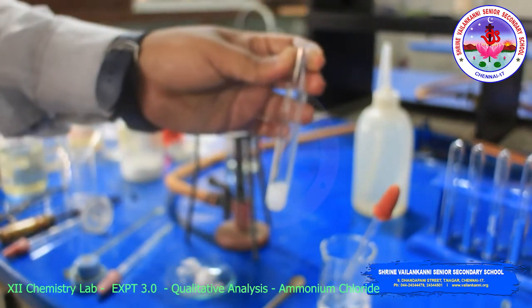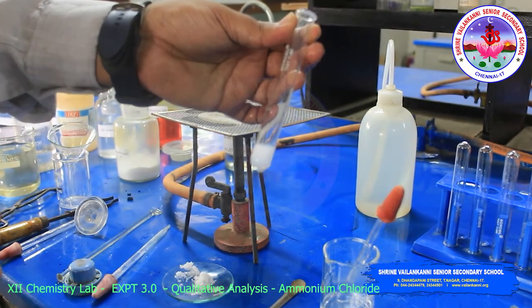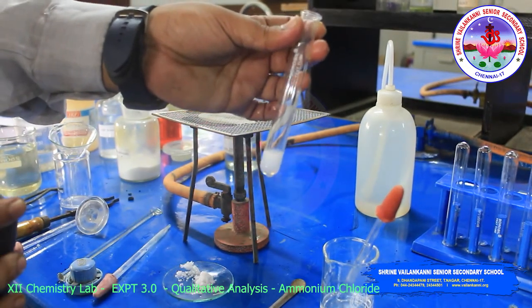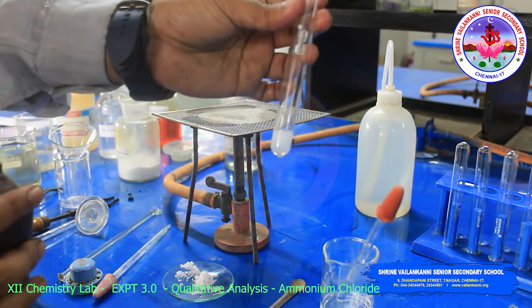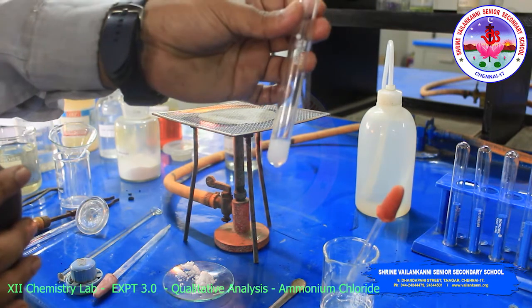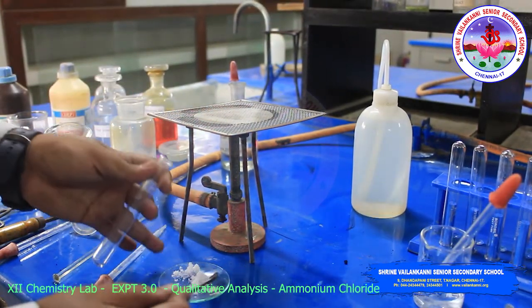Look, this curdy white precipitate is obtained on adding silver nitrate. So this shows chloride is confirmed. Now we will do the basic radical. Now we have to prepare the original solution.